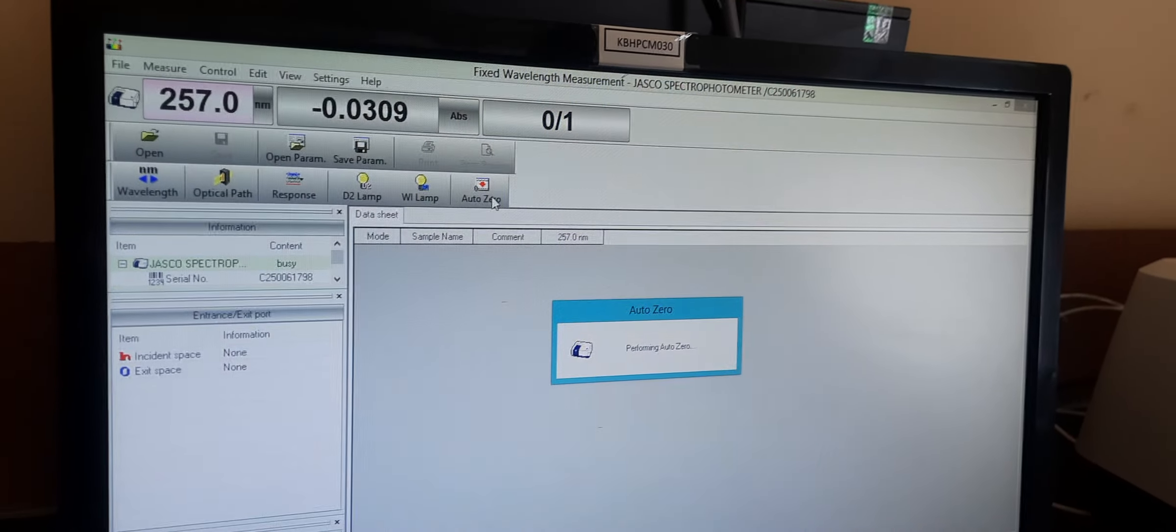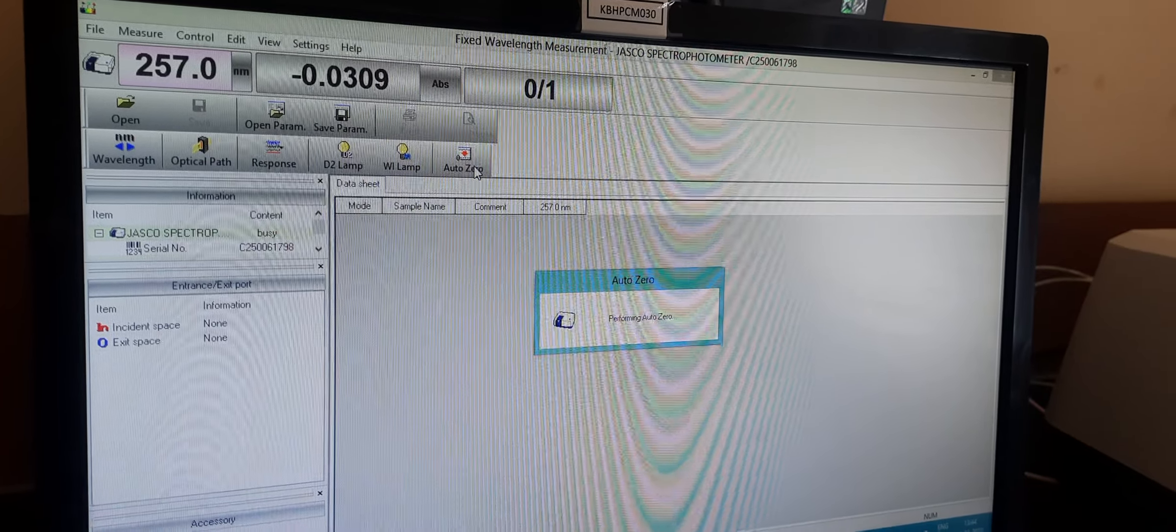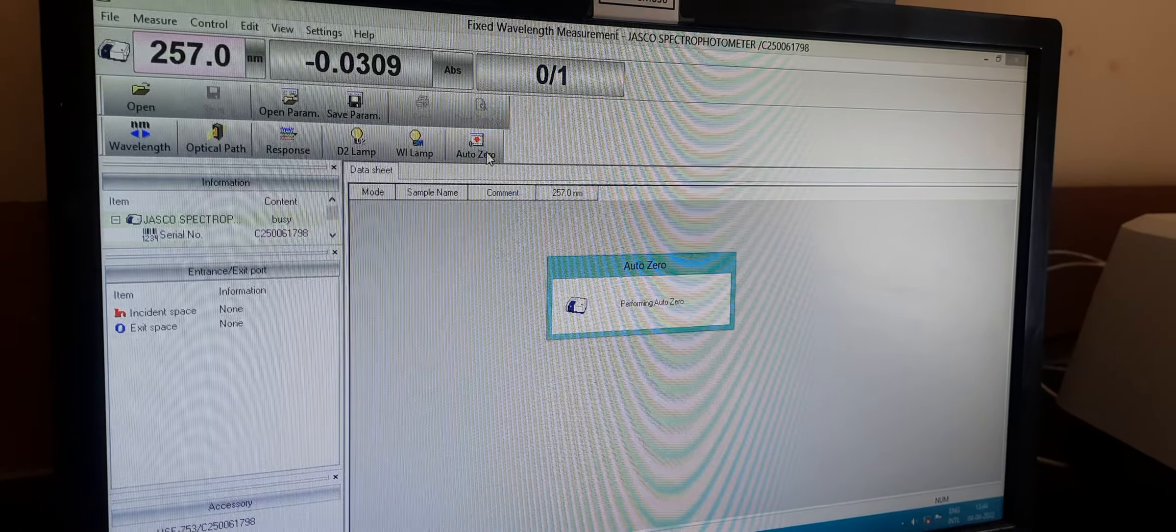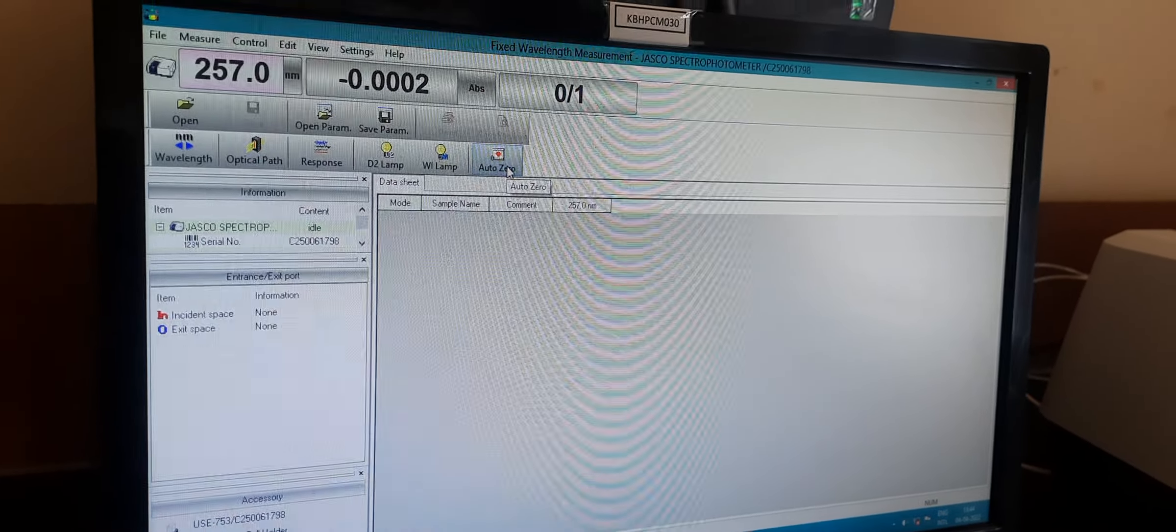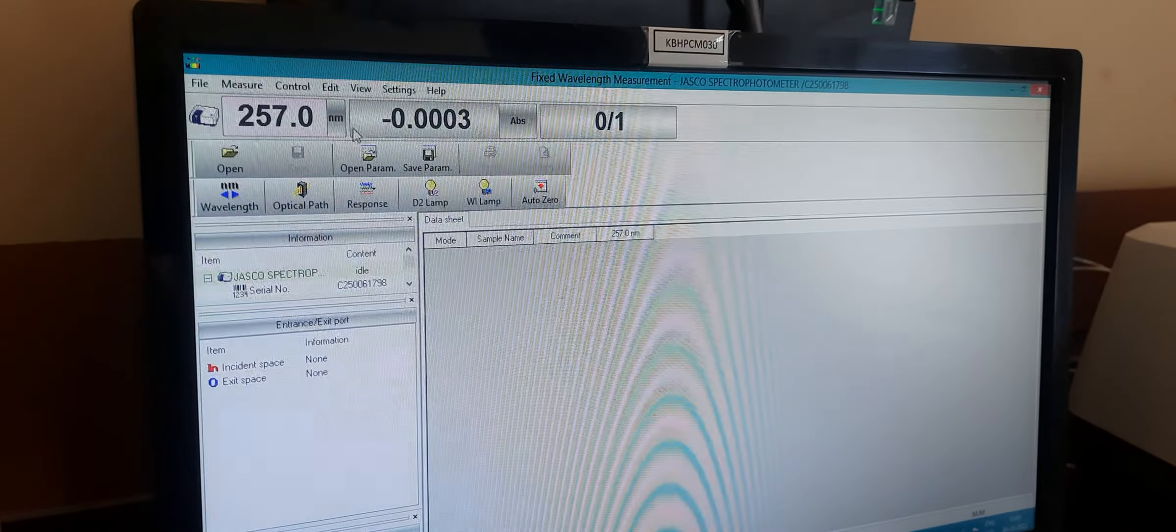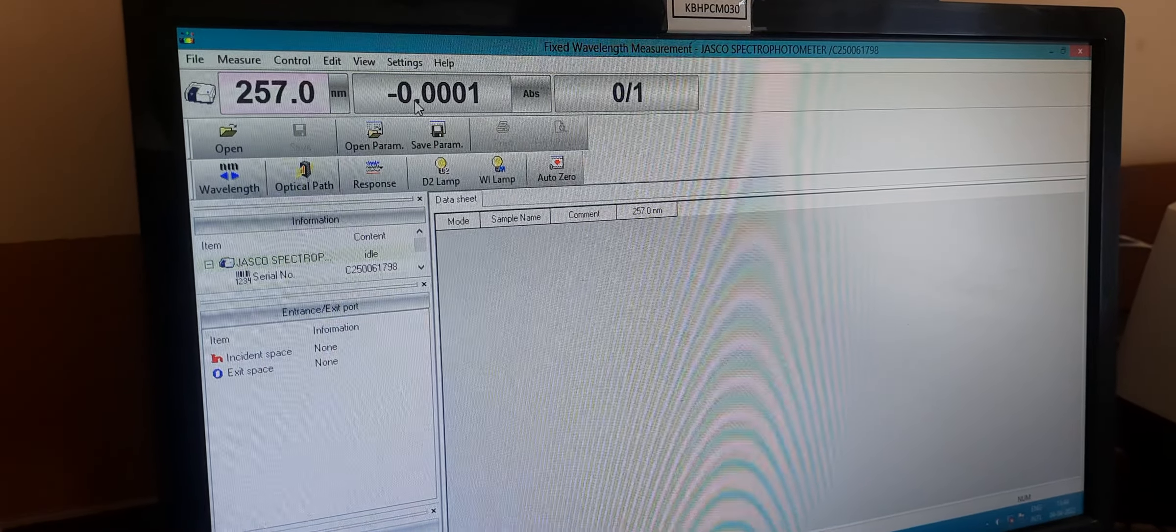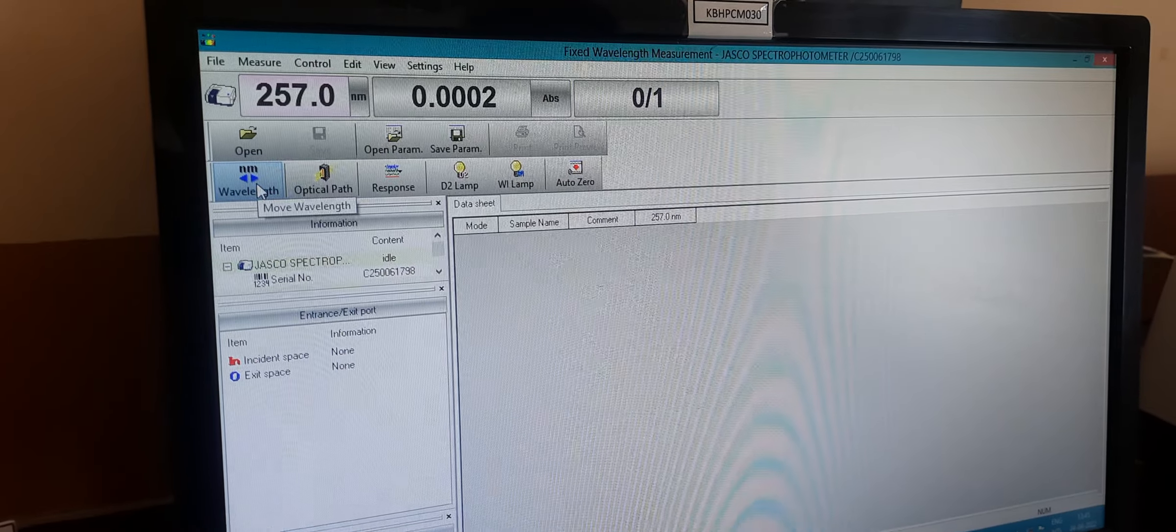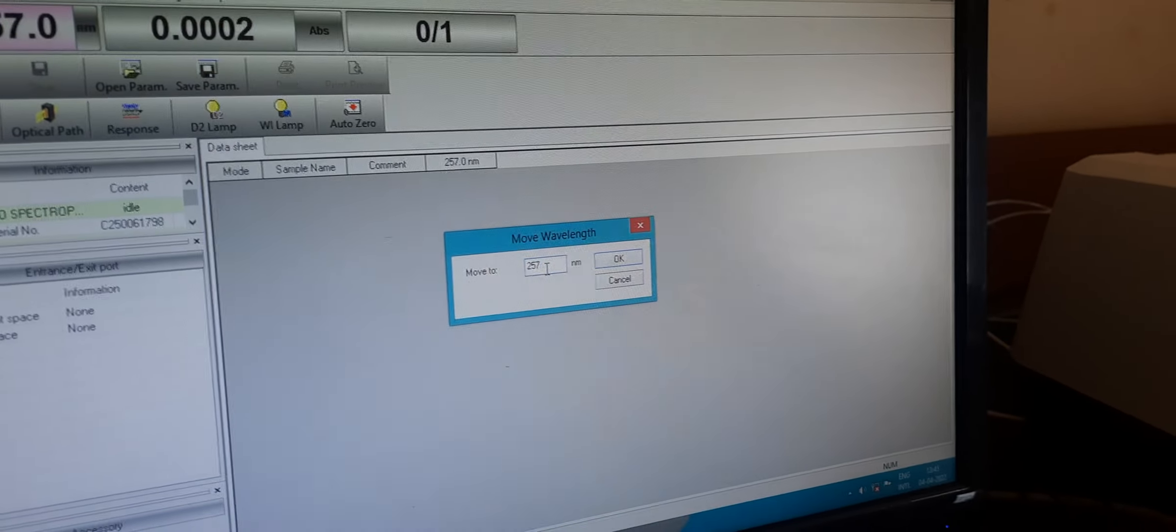After that, we can see the absorbance. Then click on the wavelength button and enter the nanometer value which we already know. Here I am putting in the wavelength of paracetamol.